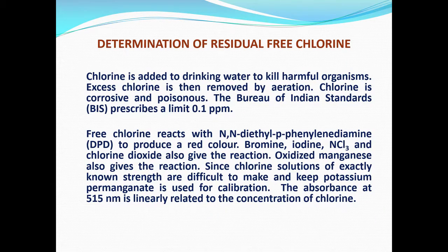There are several methods, but for the time being we are recommending this. If this method does not work because of interferences etc., then you will have to look at the arsenic hydride method.